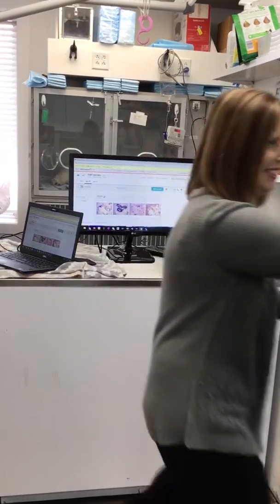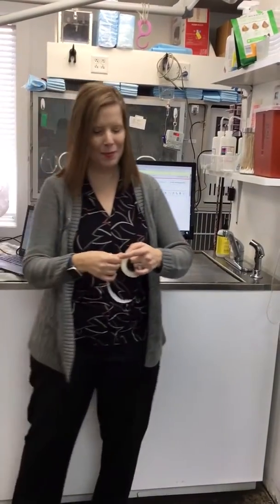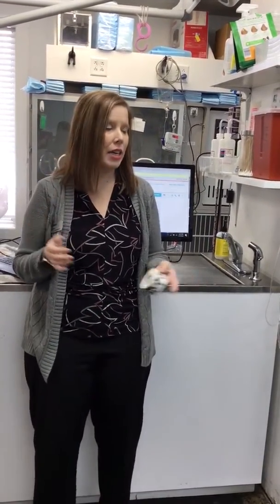Yes, you always want to append. The reason you want to append is if you hit merge and replace, all of those previous images are out the door. So even though you didn't get a numerical result, you have those pictures. So append on anything. Append is your best friend.